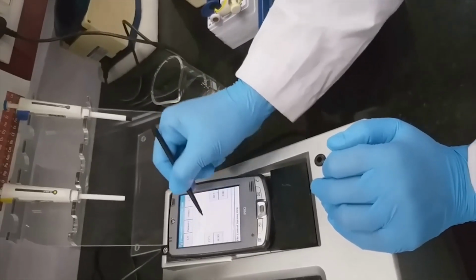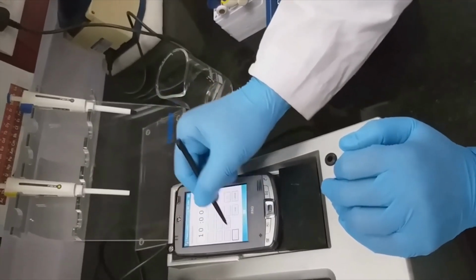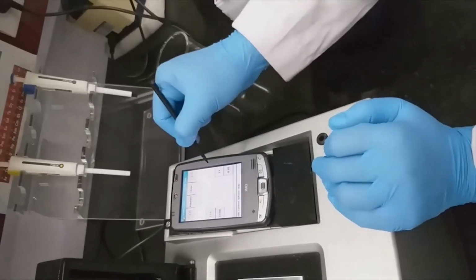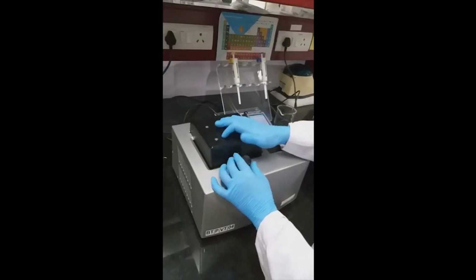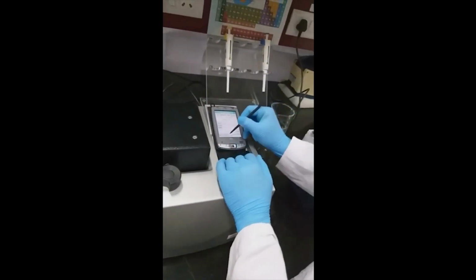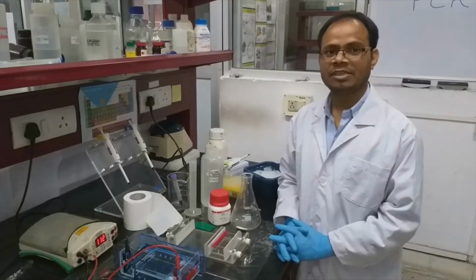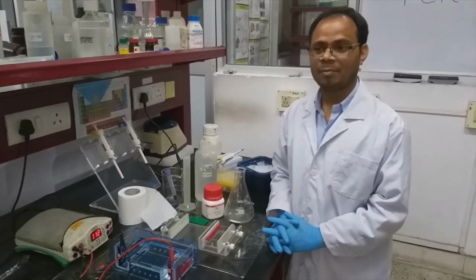Here the final extension should be given 10 minutes, and then hold it at 4 degrees Celsius.